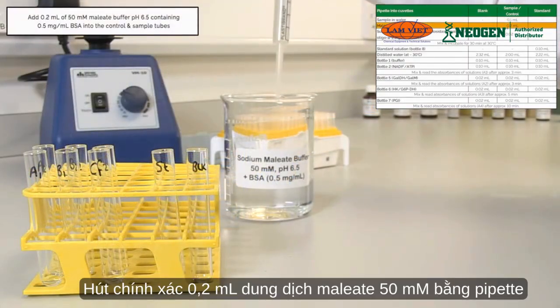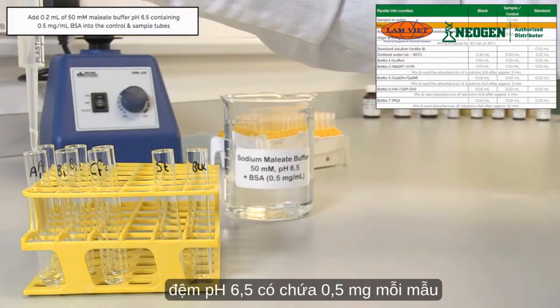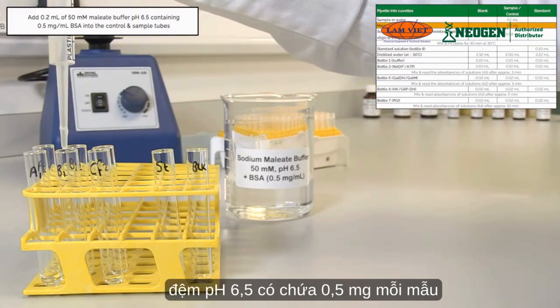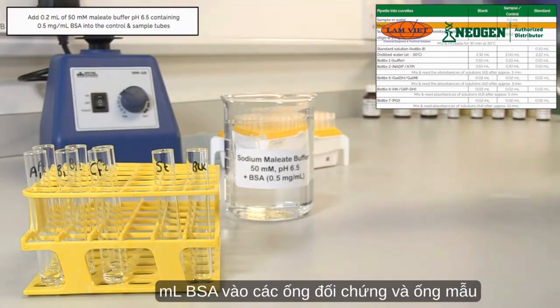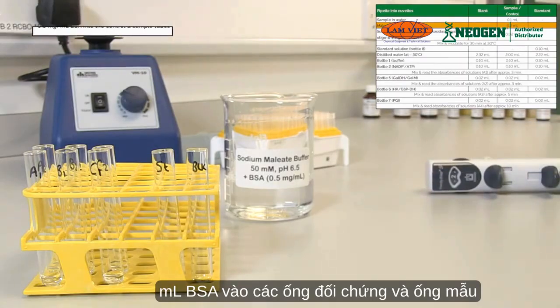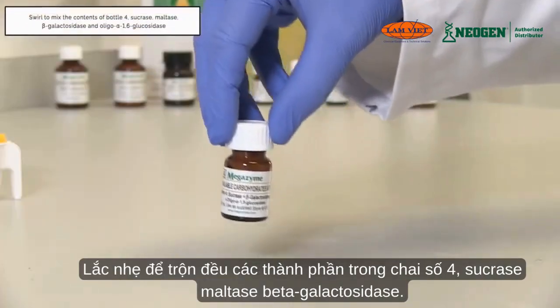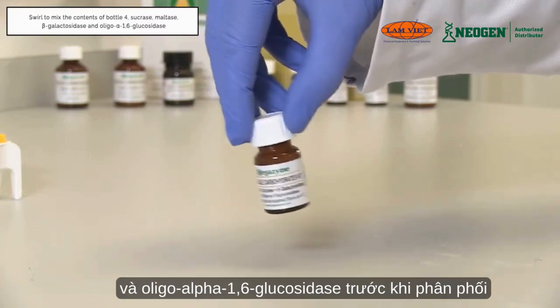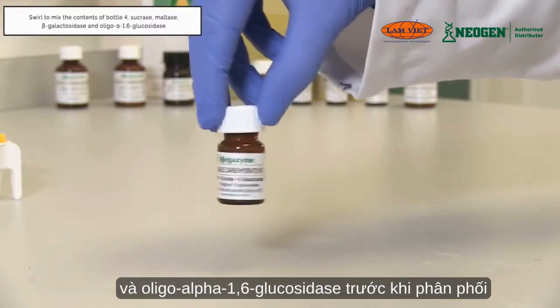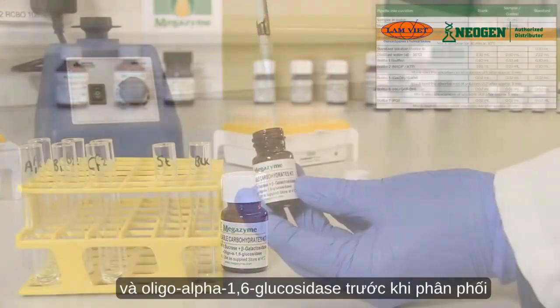Pipette 0.2 ml of 50 millimolar maleate buffer pH 6.5 containing 0.5 mg per milliliter of BSA into the control and sample tubes. Swirl to mix the contents of bottle 4, sucrase, maltase, beta-galactosidase and oligo-alpha-1,6-glucosidase prior to dispensing.